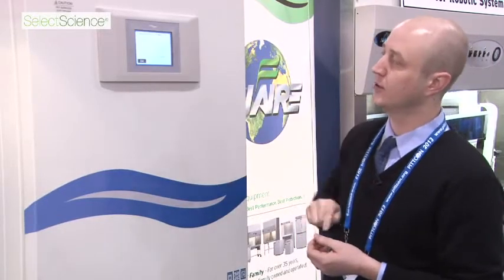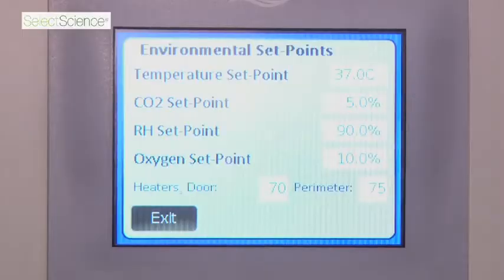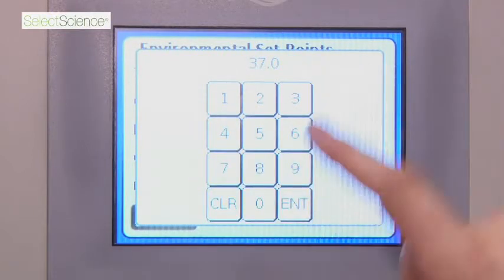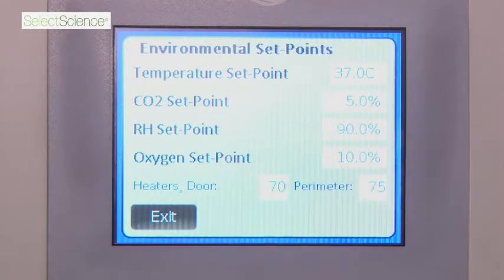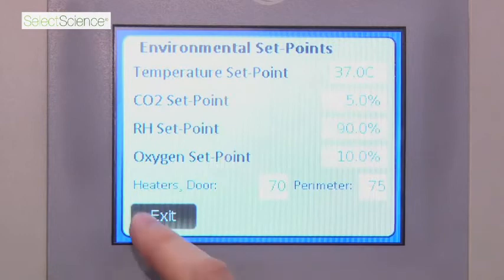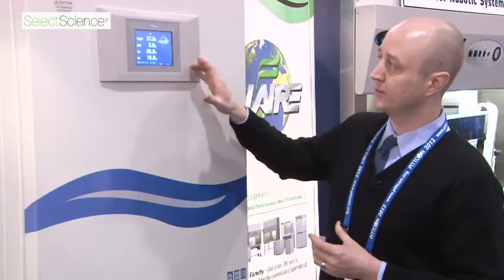If you ever need to change your set points, it is very simple. You just click on whatever you want. Here it is showing your set points for temperature, CO2, humidity, and oxygen. You just click on that, enter in your set point — usually right around 37 degrees Celsius — and hit enter. Down here you also have extra control for heater controls, which will help cut down on any type of contamination. It is very easy and simple to use.